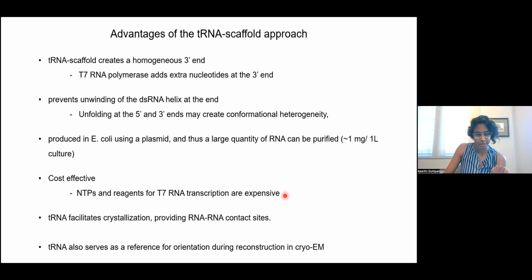Especially in crystallization, tRNA facilitates crystal contacts, and the probability of crystallization increases because of that. And then in cryo-EM, tRNA serves as a reference point to orient your maps or models when we build them in.